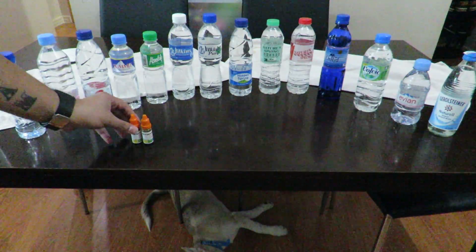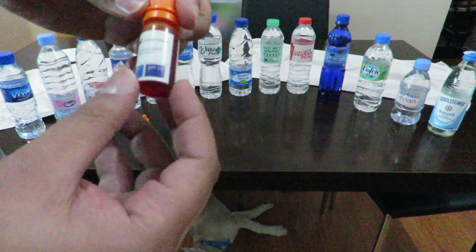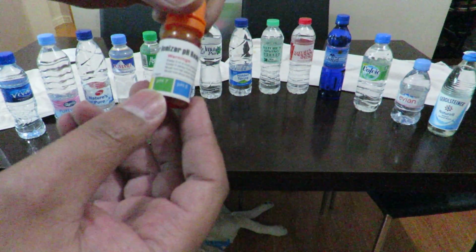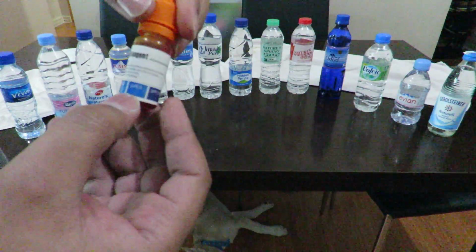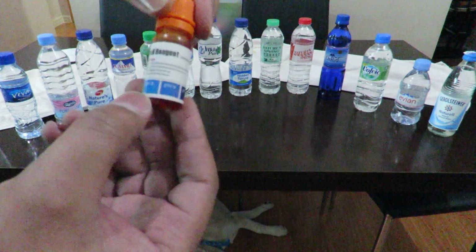For my tester, it's just a simple pH tester where purple is the best, and then pH 7 is neutral, and anything below that is bad. So you probably want to be drinking more than pH 7. You want to be over here in the blue or in the purple right here.